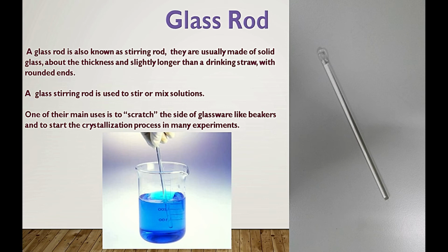One of the main uses is to scratch the side walls of glasswares like beakers and to start the crystallization process in many experiments.